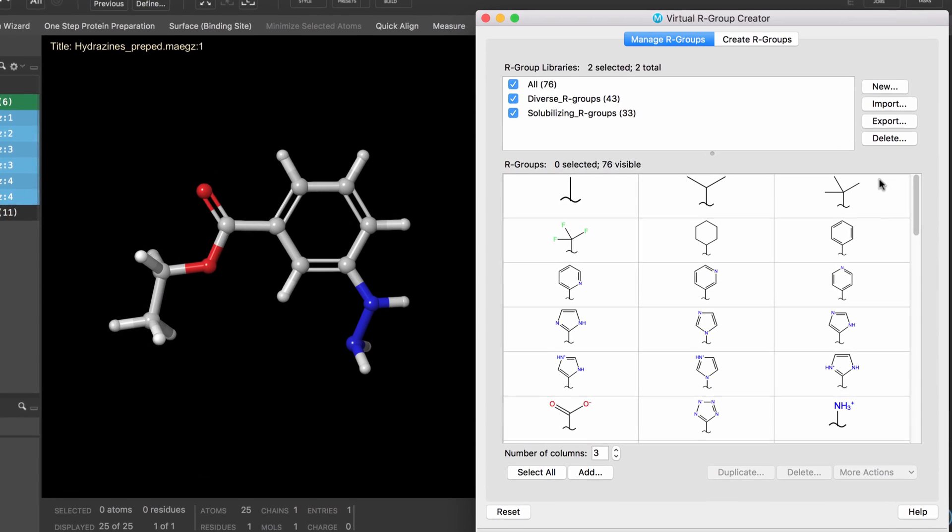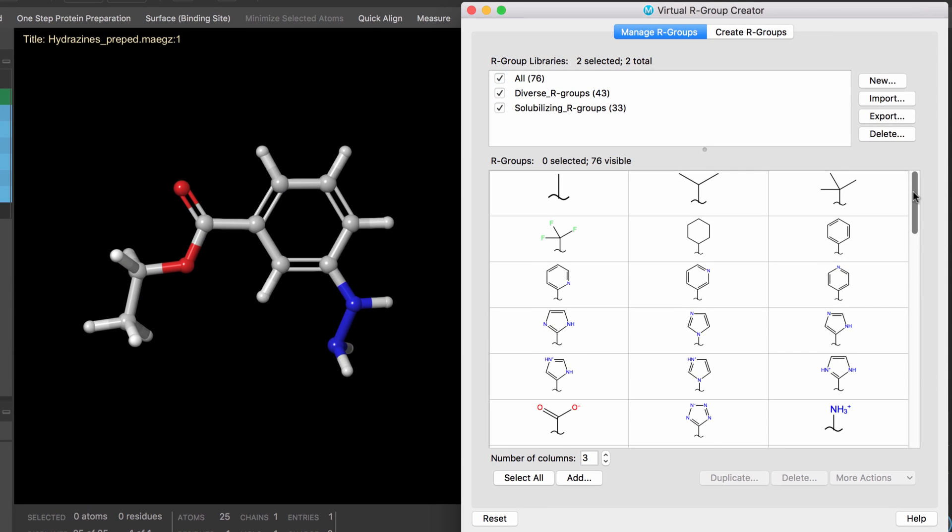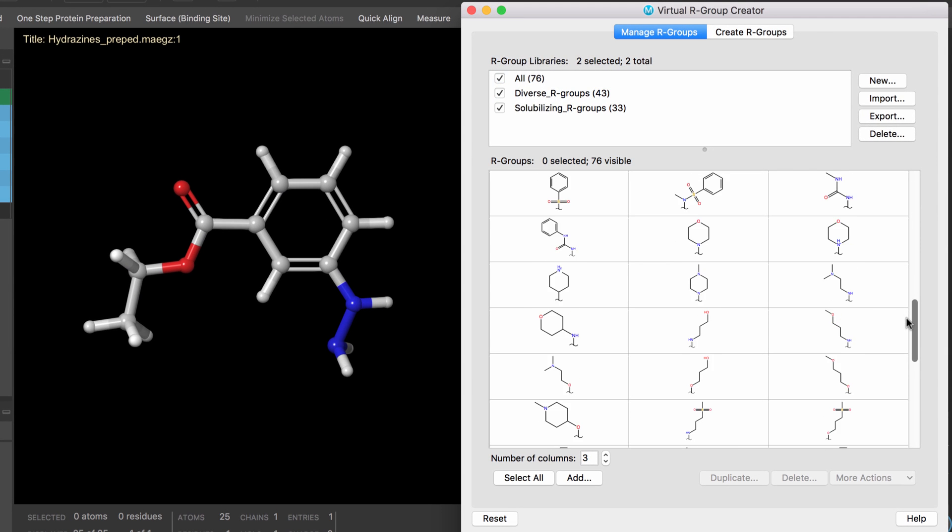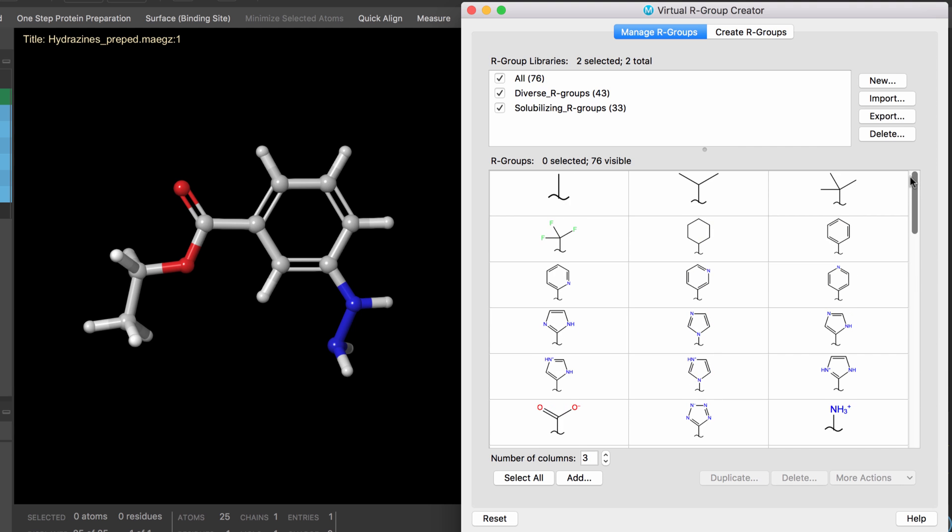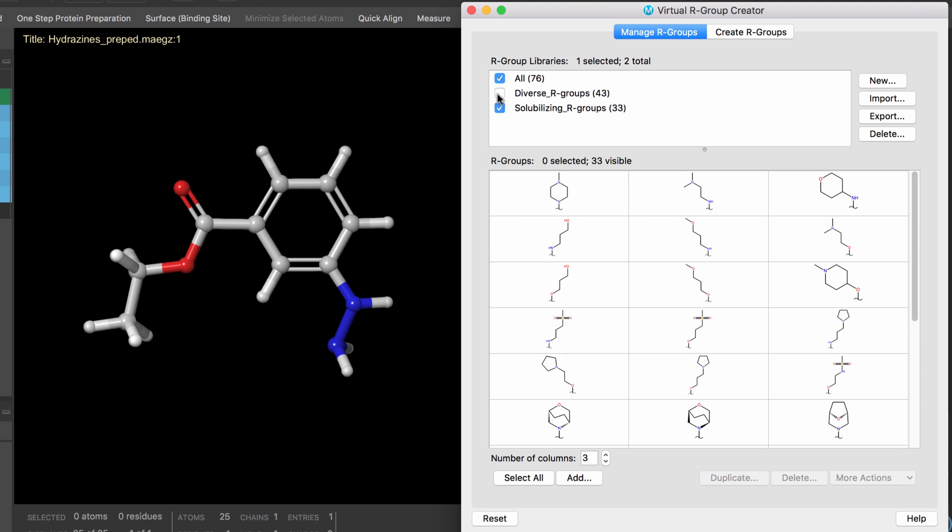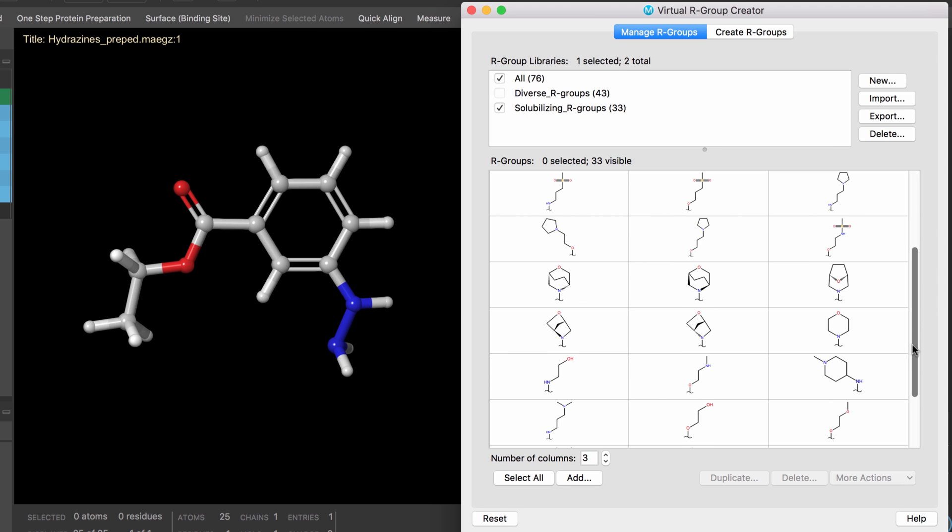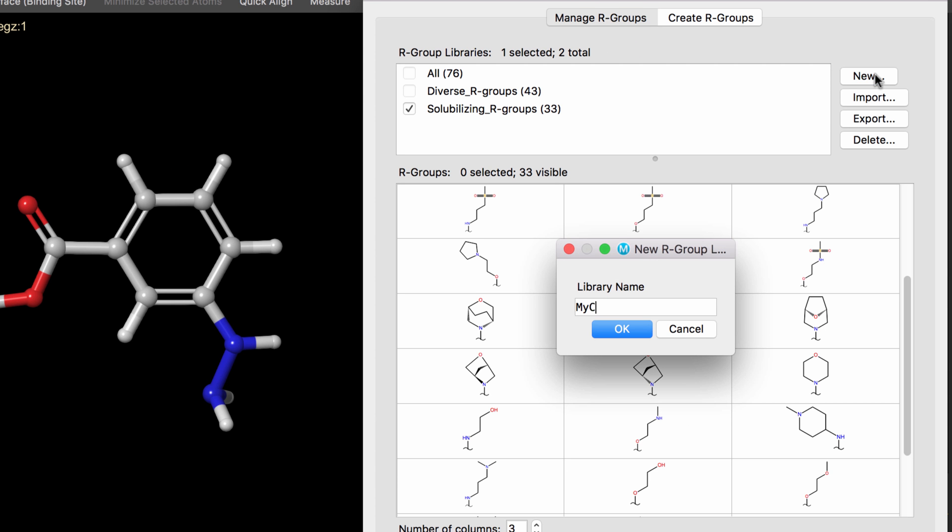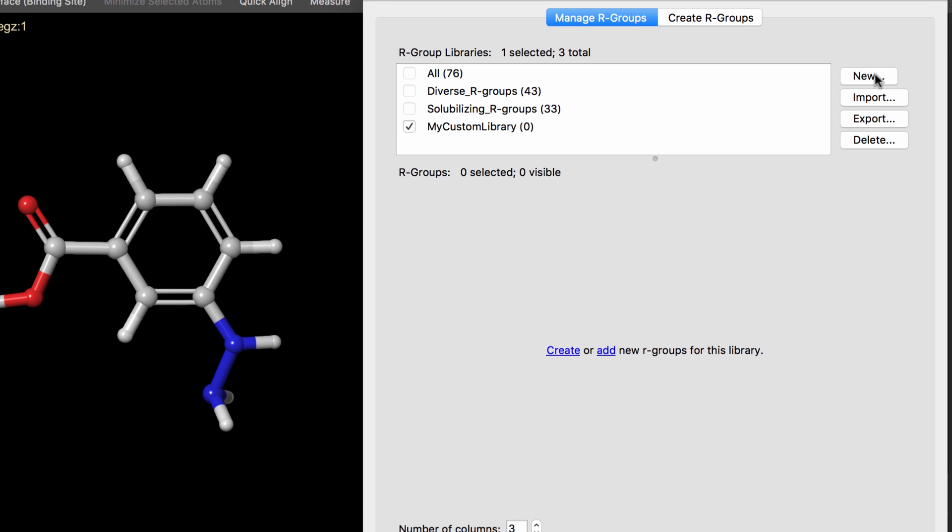Now, in the 2017-2 release, users can more easily create and choose their own R-group libraries with the R-group Creator panel. Here, users can explore and manage the R-group structures in their libraries, as well as choose to create new libraries with new R-groups.